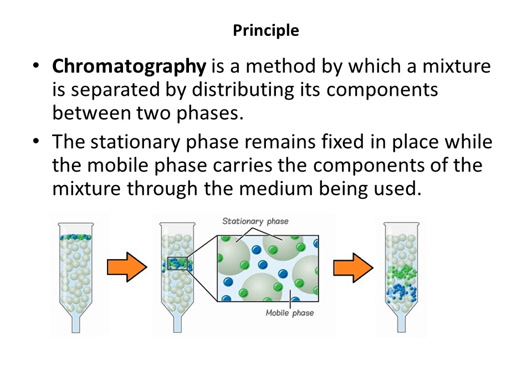Okay. So after following some technique of chromatography, you can see the mobile phase is mobile, the stationary phase molecules are not mobile. Okay, and the enlarged view is also shown here, and after some time the diffusion occurs, and you can see here based on the density or based on the technique, the molecules or the constituents of the solute are taking different places. It is separated actually. Okay.